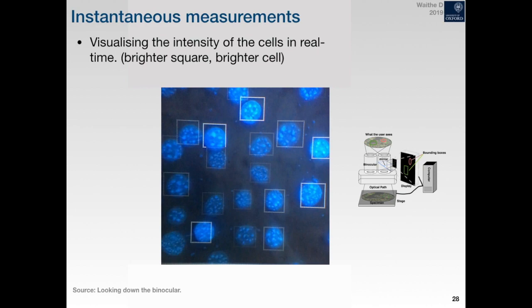And although there are aspects of these features that are learned that you can recognize from a conventional viewpoint, the real beauty of them is that they are non-linear, and they are able to combine information and utilize it across multiple levels. So it's hard to cognitively break that down and explain step by step how it works, but it does make sense because a lot of people don't really think about what they're doing, but they still function in the world, right?